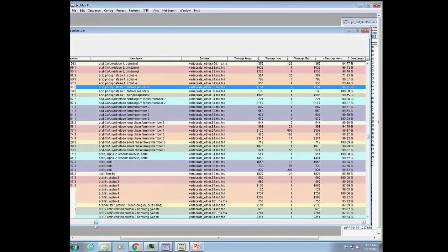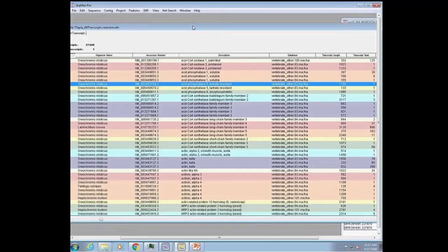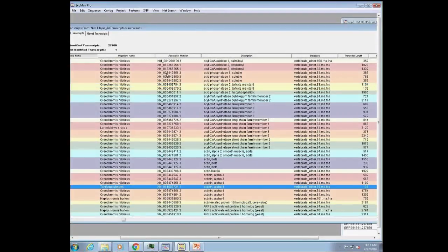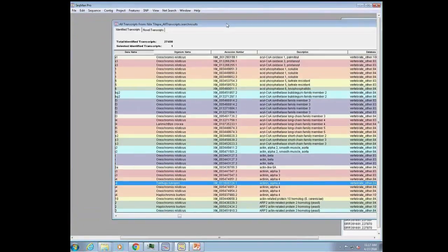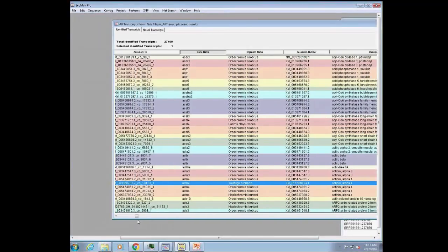And we can see also by organism that it's not all one species. One of the common questions that came up is, rather than align to the whole non-mammalian vertebrate database, should we use just a database specific to my organism? Should I go and pick just that file? And for most organisms, you'll find that you get more comprehensive annotation if you pick the entire database. You'll see there's other species here that are coming up and annotating our de novo assembled contigs.